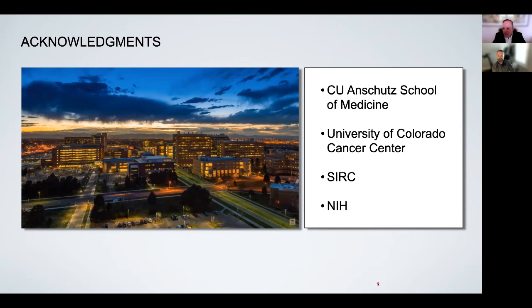Natalie, did you want to ask your question? I feel like a dummy here. So I wrote you, Francisco, in the chat. I saw both Cryo-EM as well as Cryo-ET terminology. So microscopy versus tomography. Is it really so different between 2D and 3D acquisition?